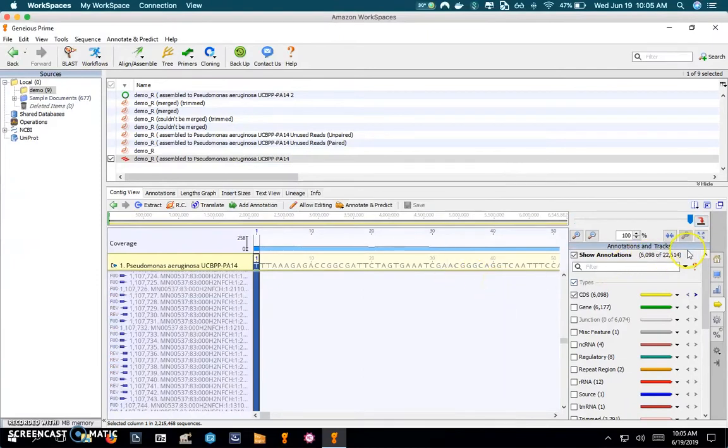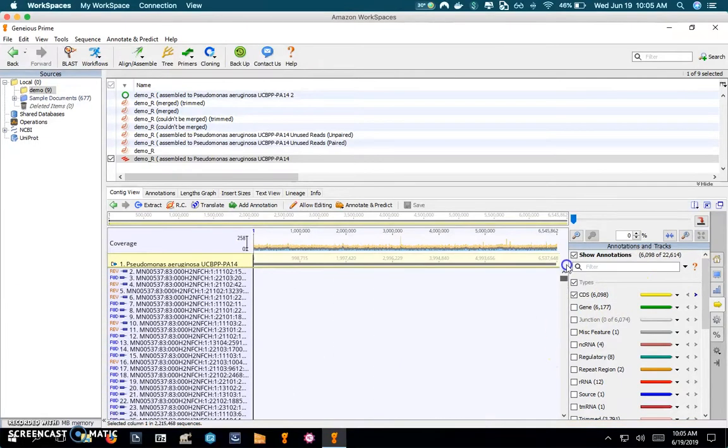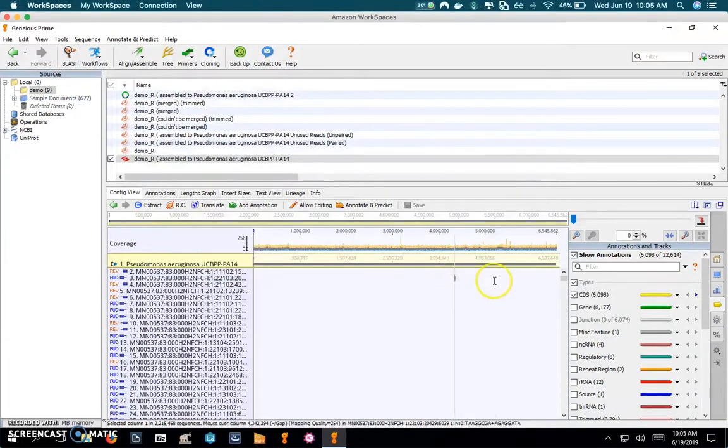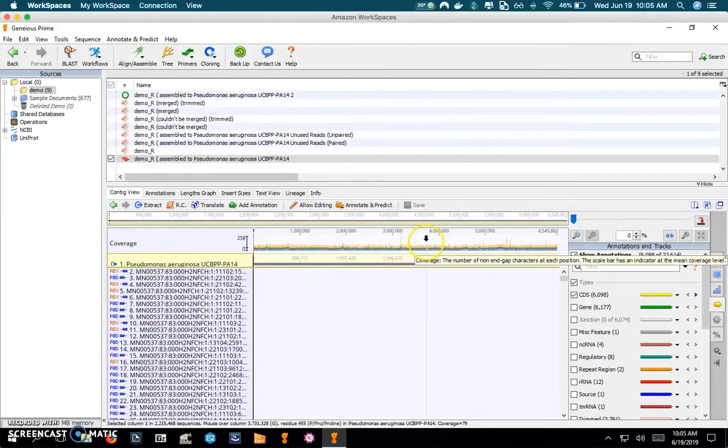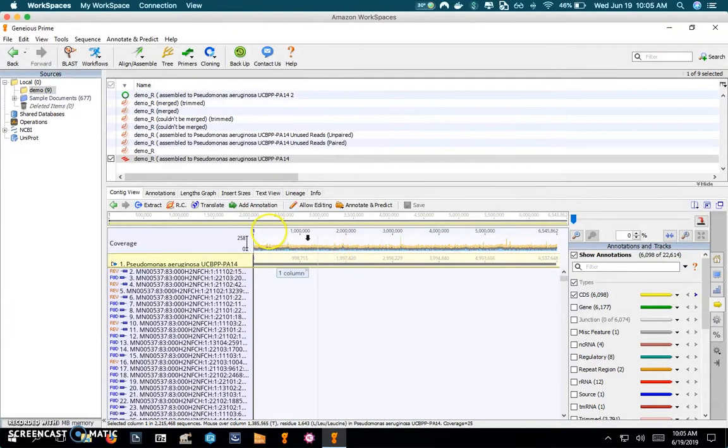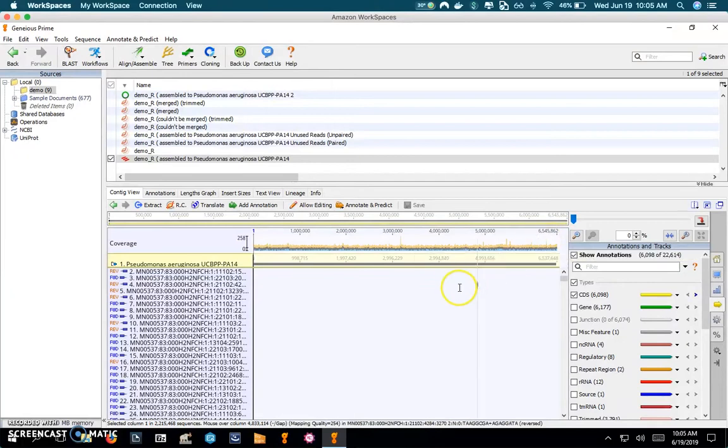Now let's scroll out here. So this first track shows the coverage across the genome, the mapped reads against the reference genome, shows the coverage from the first locus all the way over to six and a half million, which is roughly the size of this Pseudomonas genome.